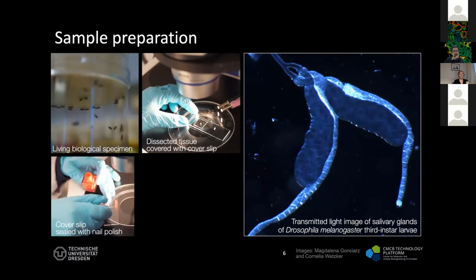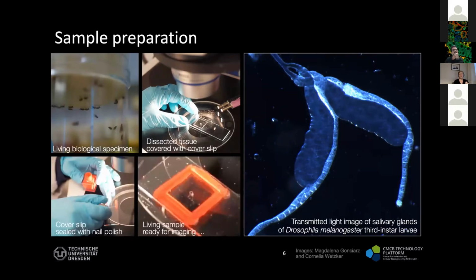So we seal the sample with nail polish in order to prevent evaporation during the measurement. And then the sample is ready for imaging. And with this, I hand over to Ali for the introduction of the instrument and live and recorded sessions of measurements.